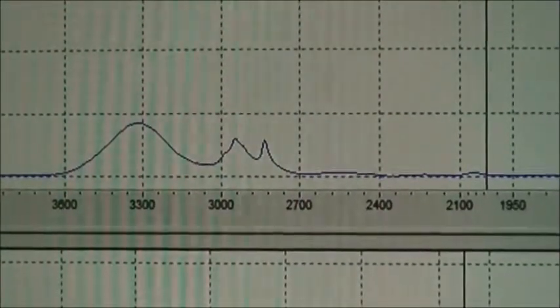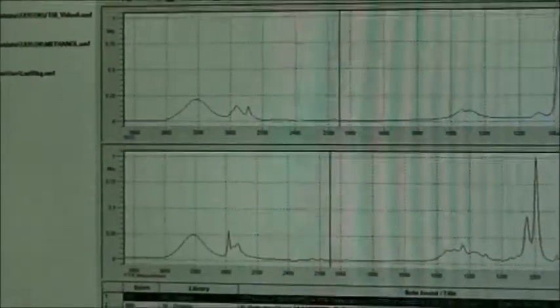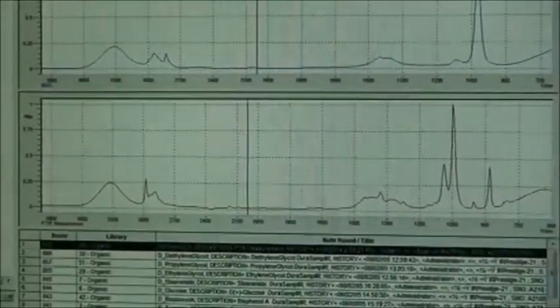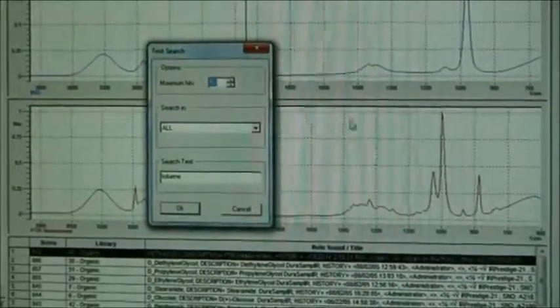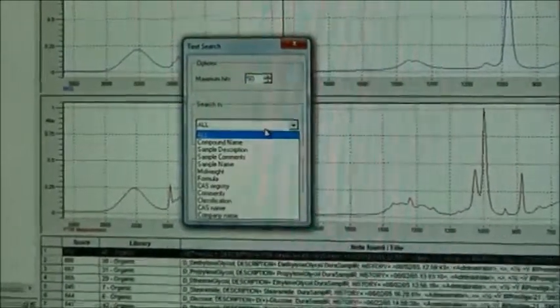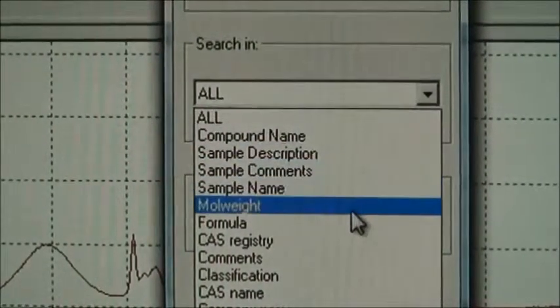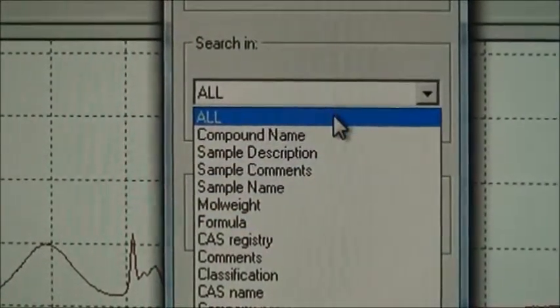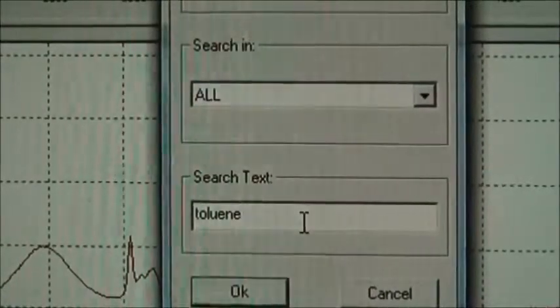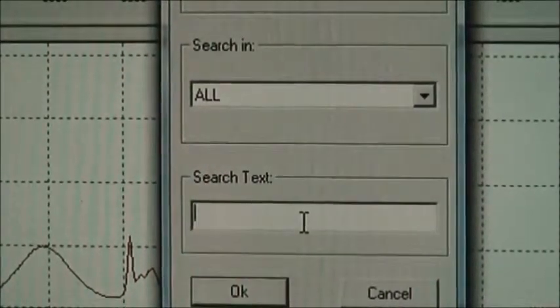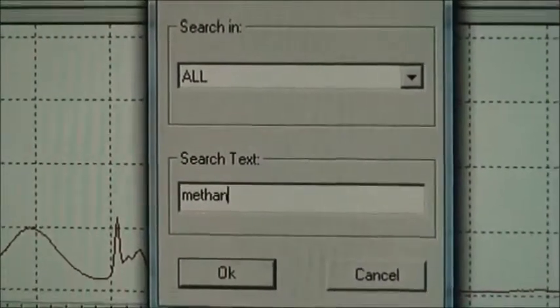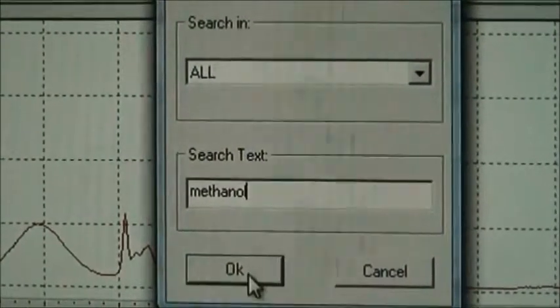So that's one thing you can do. If you want to do a text search, you can search compound name, sample description, sample name, molecular weight formula. We're just going to search for all that. And let's say if I were to search methanol.